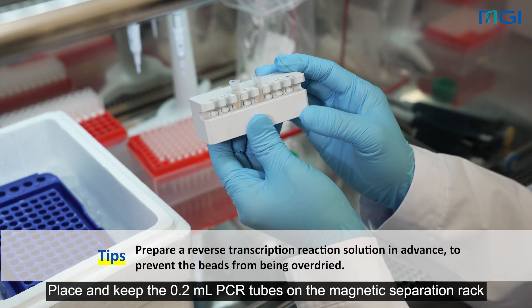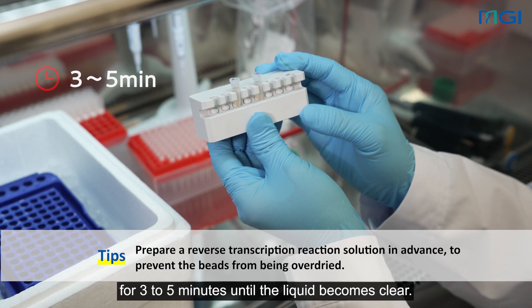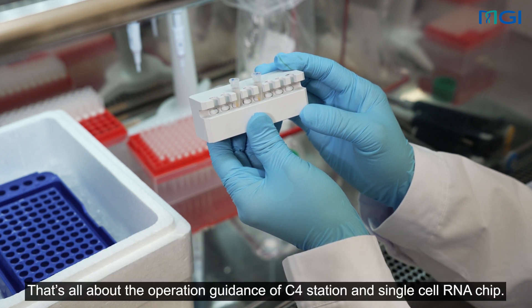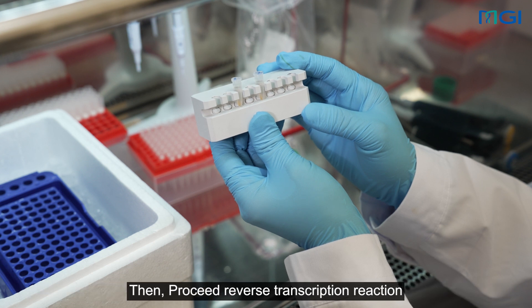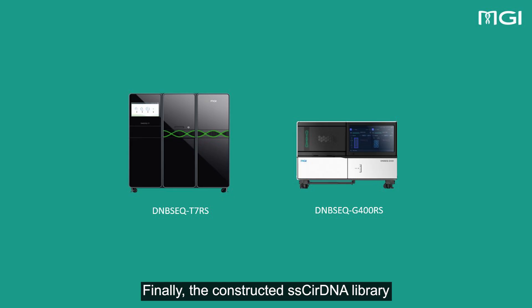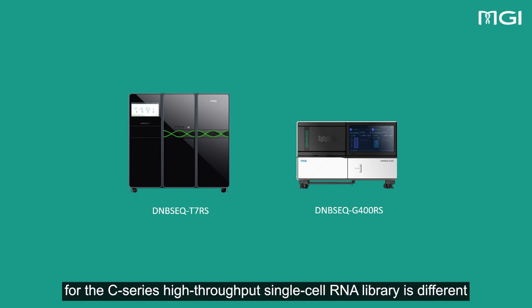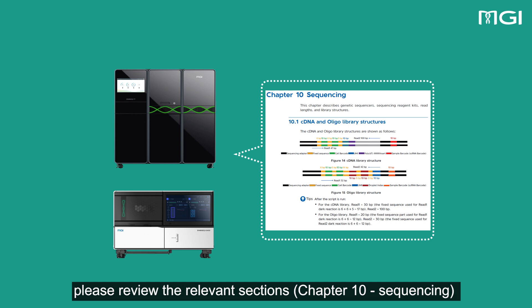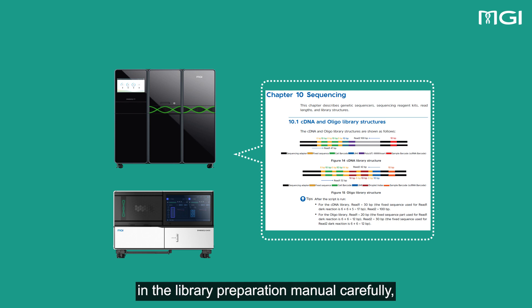Do not discard the tip. Add another 200 µL of 6X SSC to the 1.5 mL centrifuge tube with the pipette. Pipette and rinse the remaining beads to mix them thoroughly. Evenly transfer the suspension into the two 0.2 mL PCR tubes. Place and keep the 0.2 mL PCR tubes on the magnetic separation rack for 3 to 5 minutes until the liquid becomes clear. That's all about the operation guidance of the C4 station and single-cell RNA chip. Then, proceed with the reverse transcription reaction and following steps according to the user manual.